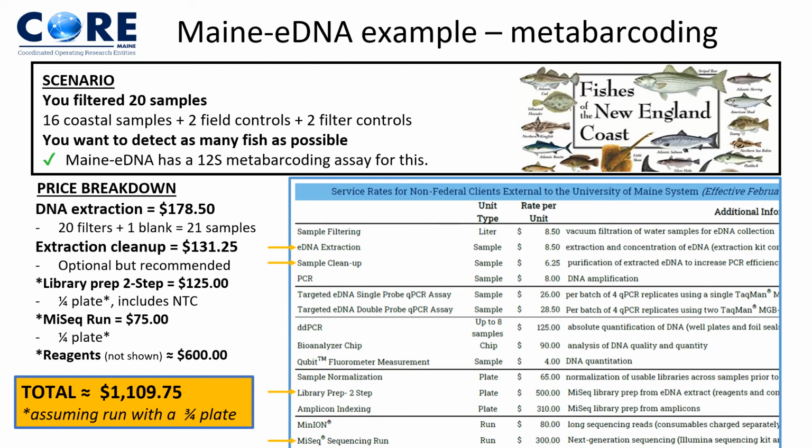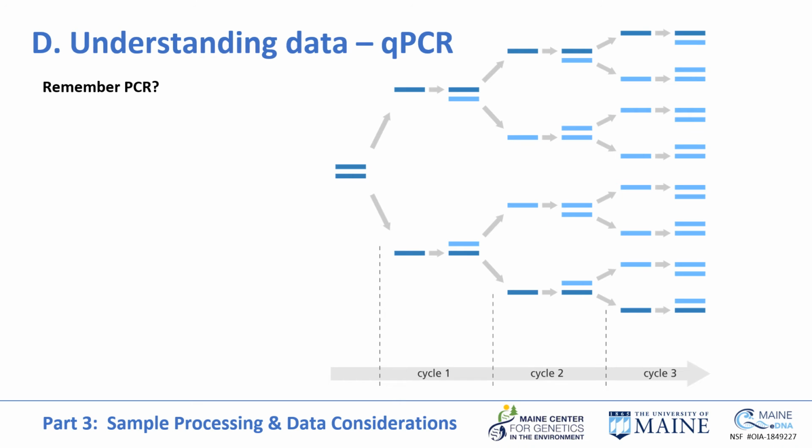Hopefully that made sense. Now for this last section of the talk, I just want to walk you through really quickly the different types of data that you can expect to see from these different assays. We'll start with qPCR first.